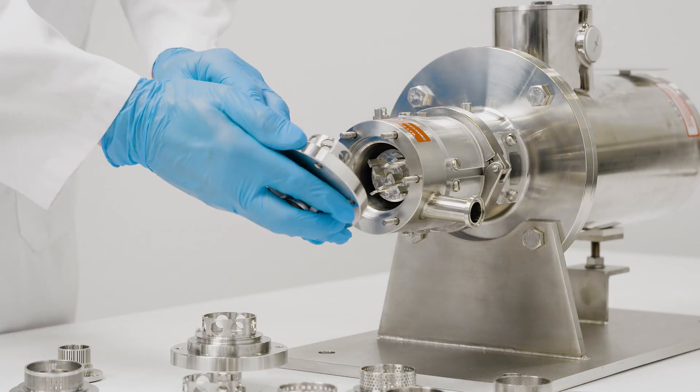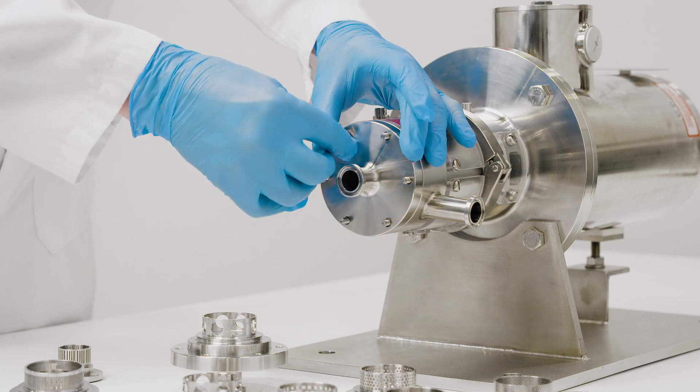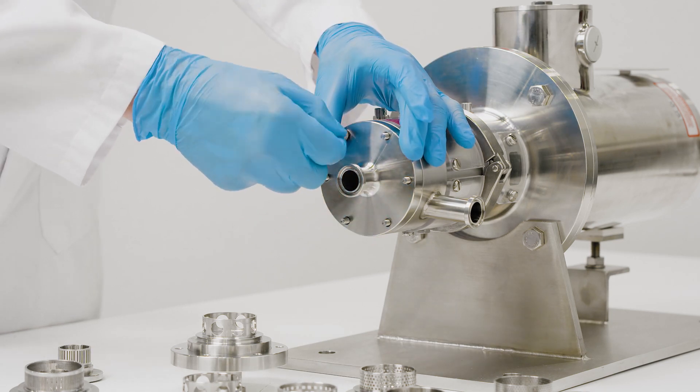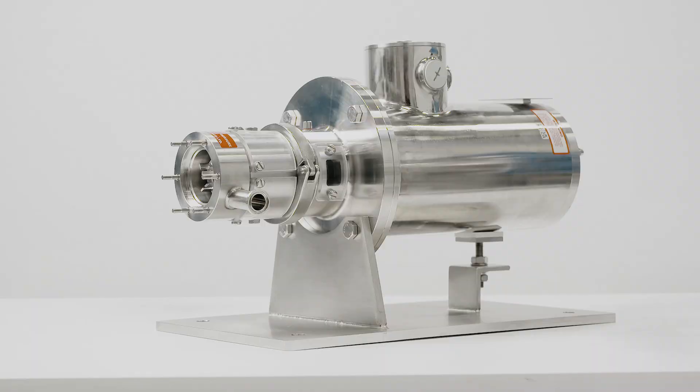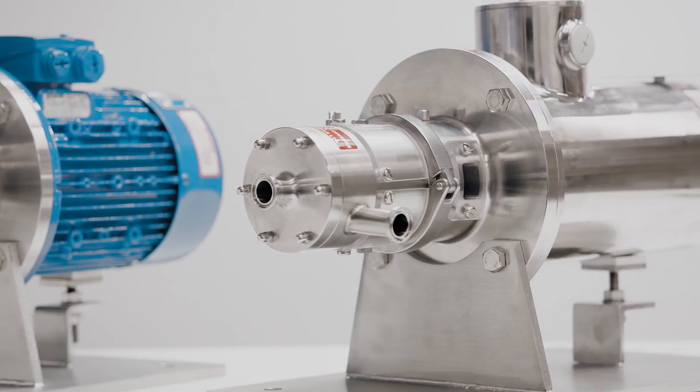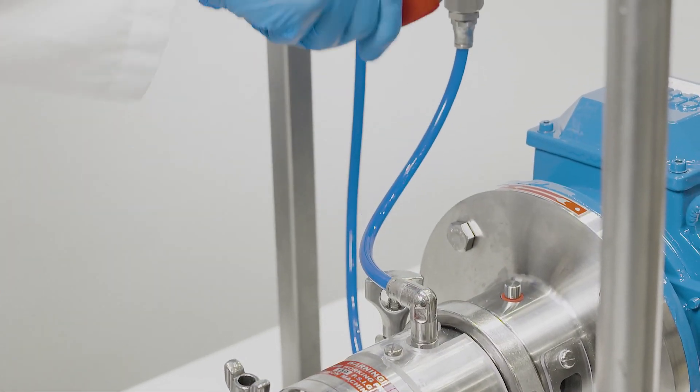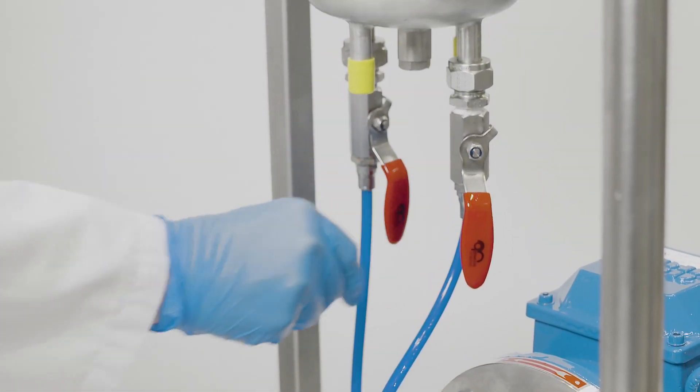The multi-stage workhead allows customers to configure the mixer to their individual requirements. These models are available with several options, including high-speed, flame-proof, and stainless steel motors, as well as sealing arrangements including ultra-sanitary single and double mechanical shaft seals suitable for pressurized flush or use with thermosyphon systems, and a complete vessel package.